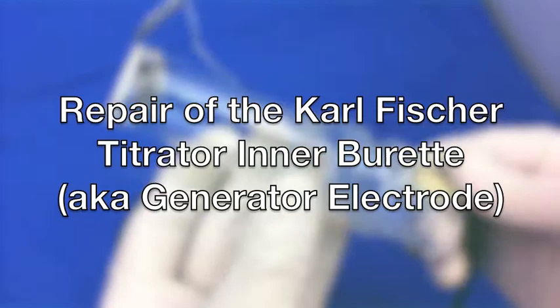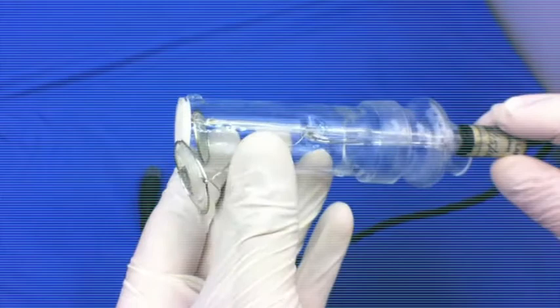This is a generator electrode, also referred to as an inner burette. As you can see, this generator electrode has been damaged where the platinum wire and screen have become detached.